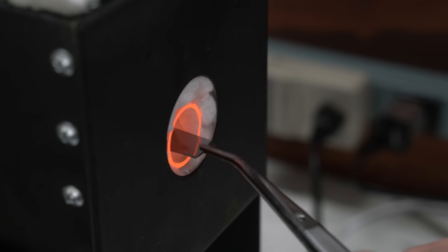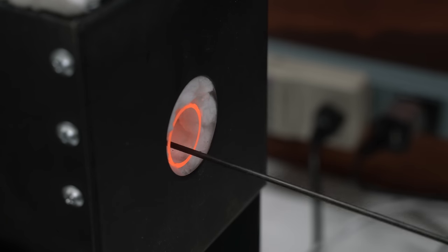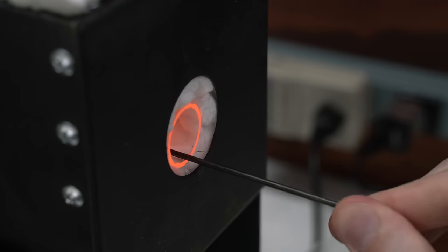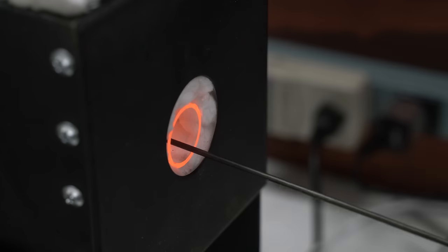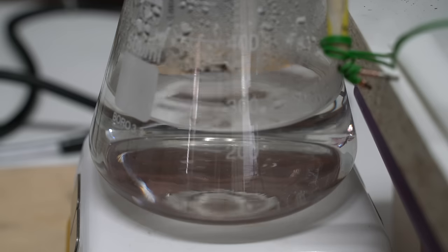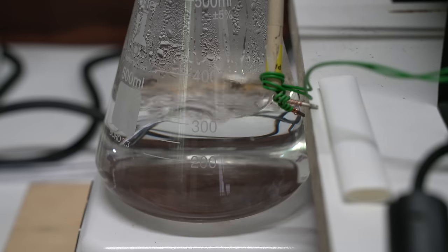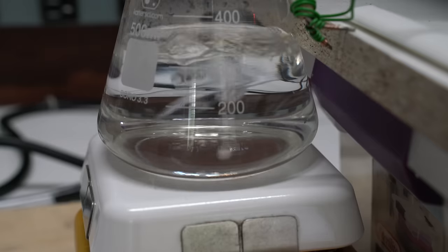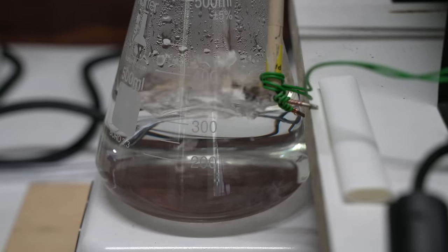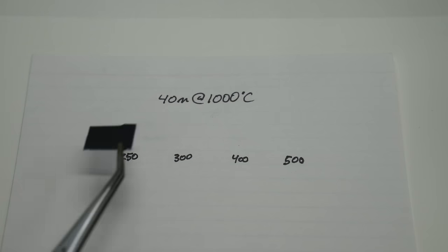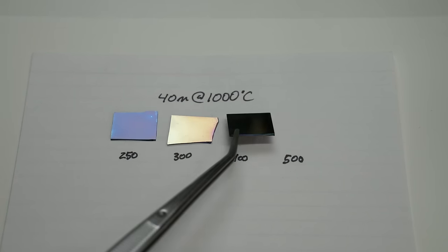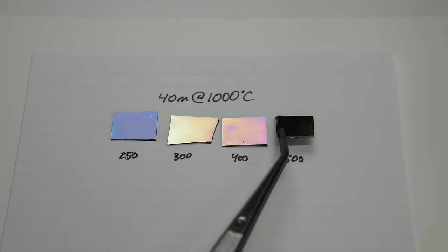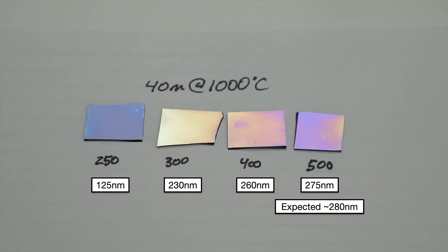I decided to run the same recipe of 40 minutes at 1000 degrees celsius, but this time I changed the setting on the hot plate from 250 celsius to 300 celsius, 400 celsius, and 500 celsius. Here are the results. It's clear here that the setting on the hot plate is very relevant. Here's my best guess on oxide thicknesses. As you can see, 250 C is wildly insufficient, and we only reach our expected oxide thickness at about 500 C.